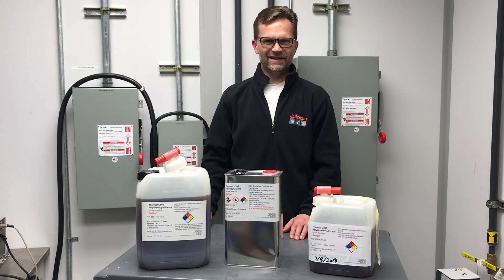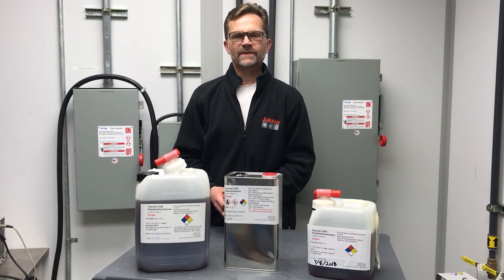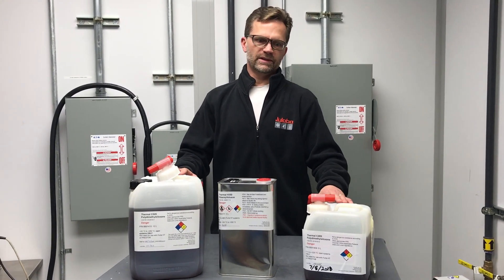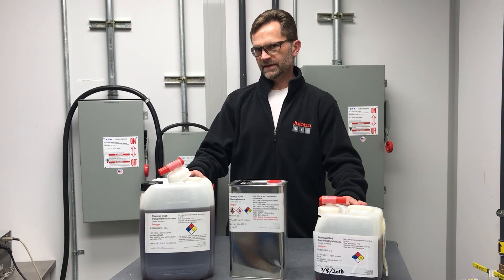Welcome to JULABO. Today I would like to discuss our high-temperature bath fluids. For open bath heating circulators, we offer two silicone-based fluids: Thermal C20S and Thermal C50S.